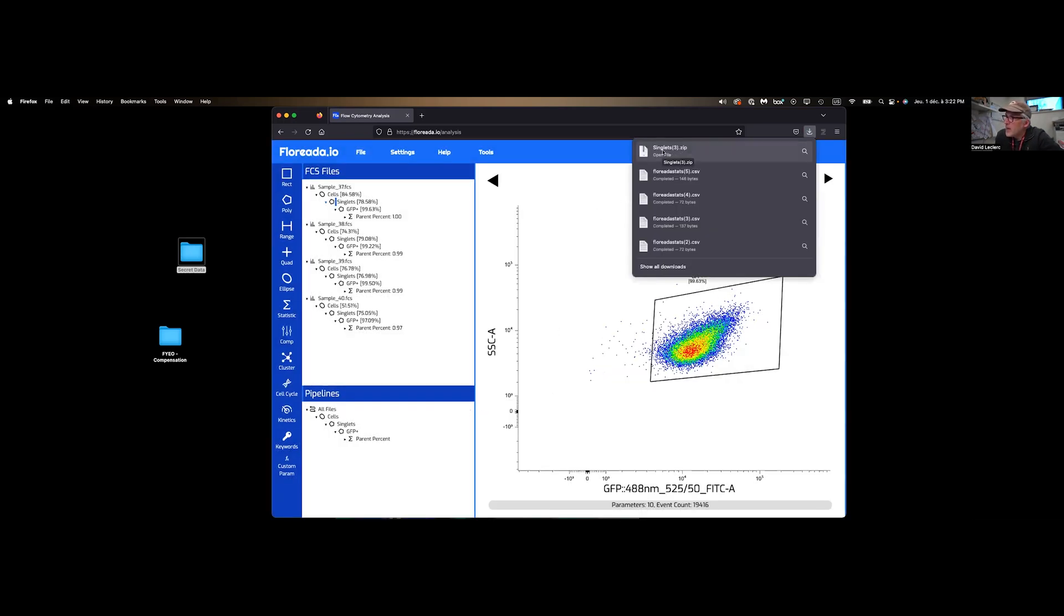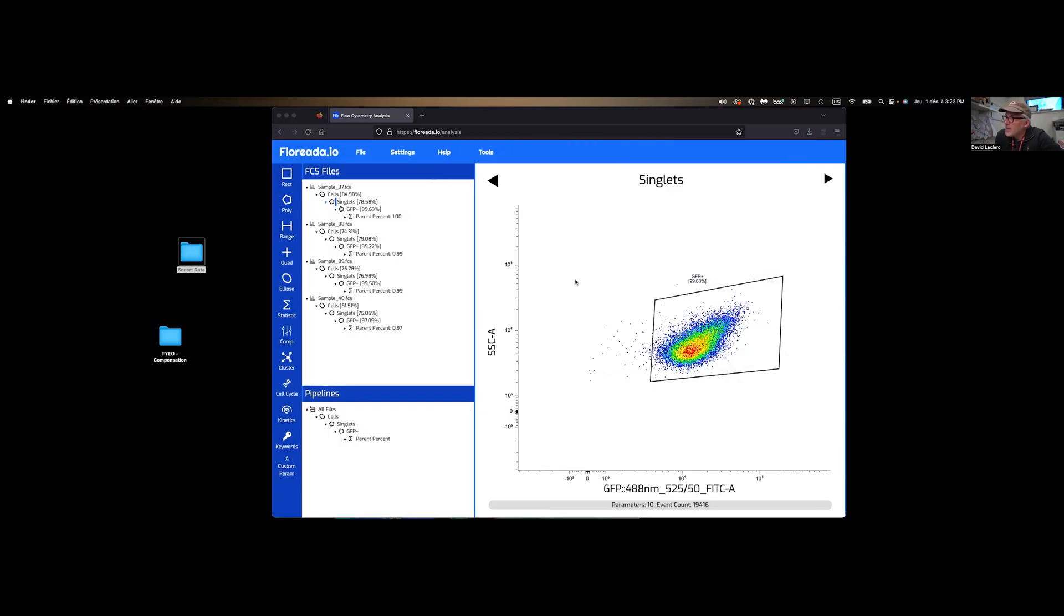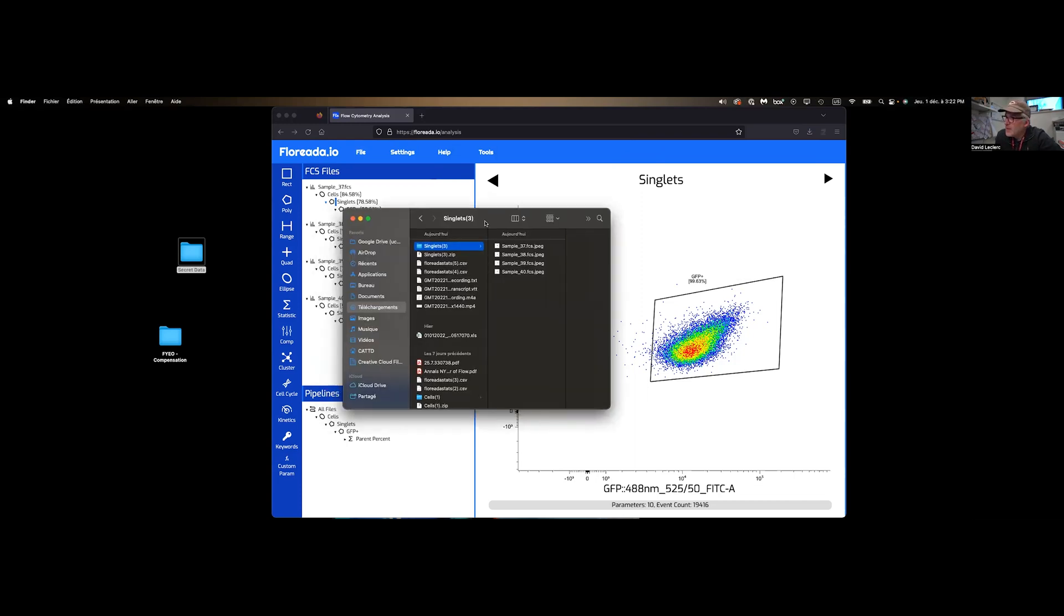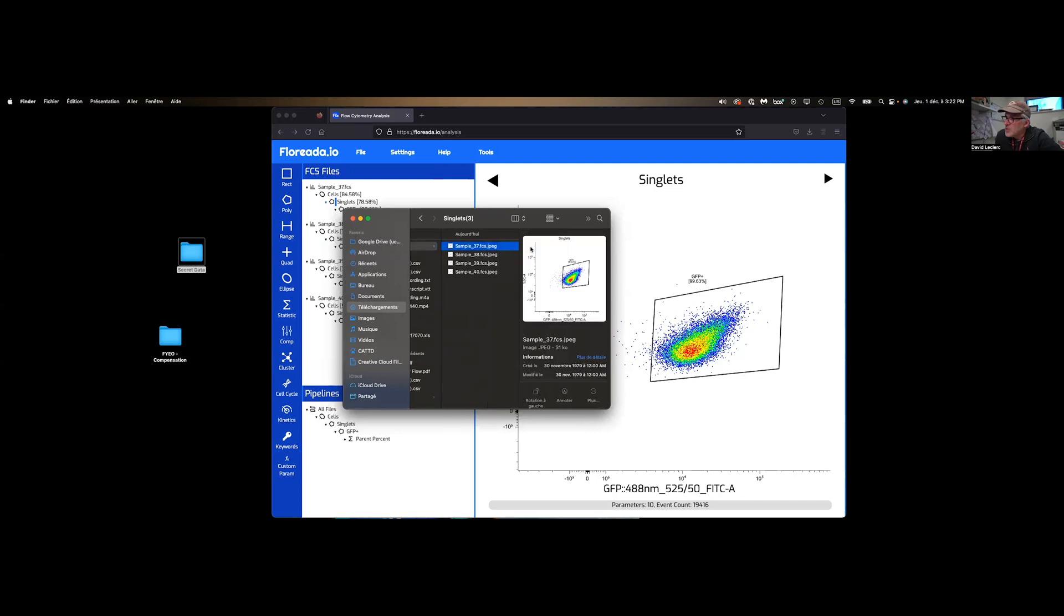And now I have a bunch of figures that just showed up in my download folder. So we are quite happy.